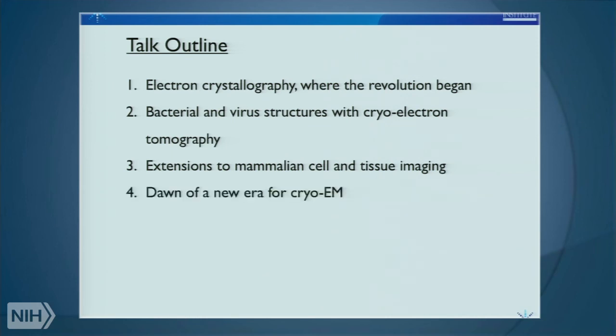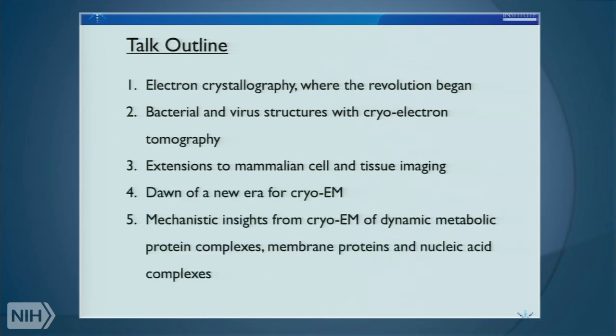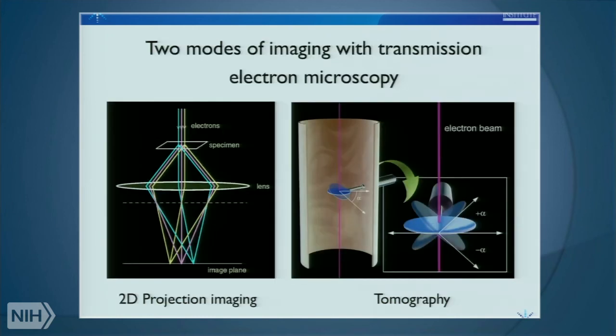And then in the next portion, which really is the primary focus of the talk, I'd like to touch on new developments in cryo-EM and how we are using cryo-EM, and the field across the world is actually using it to get after structures that were previously intractable and to learn the mechanism of how these assemblies work. And finally, very briefly, a perspective on where this all might be headed and how NIH might play a role in disseminating this technology.